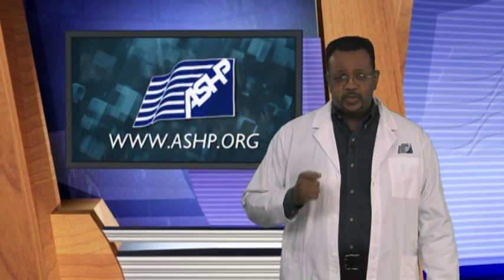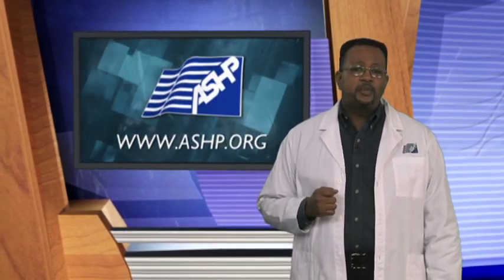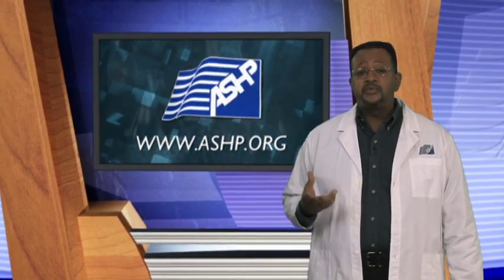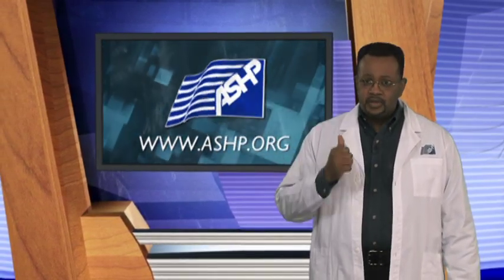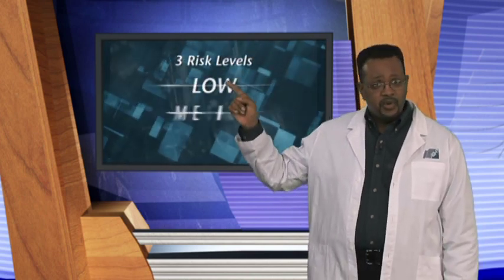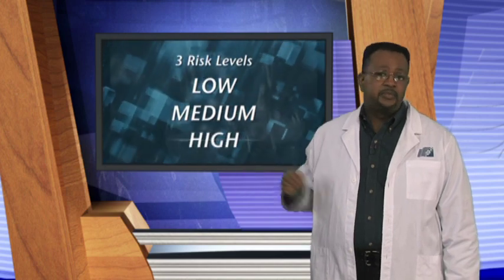USP Chapter 797 establishes 3 contamination categories for CSPs based on the potential for microbial contamination. These categories are also referred to as the 3 risk levels: low, medium, and high. Low-risk CSPs are compounded under all the following conditions and, as a result, are at low risk of contamination.